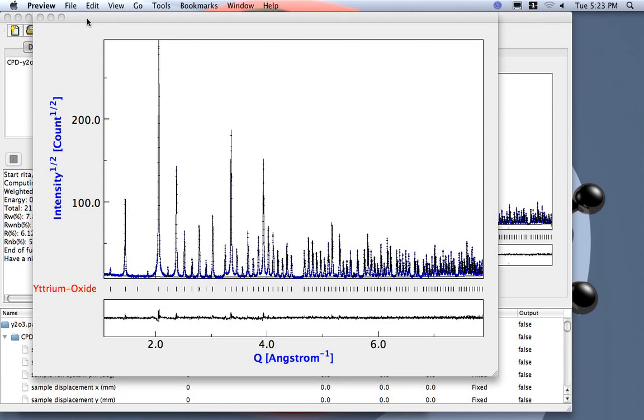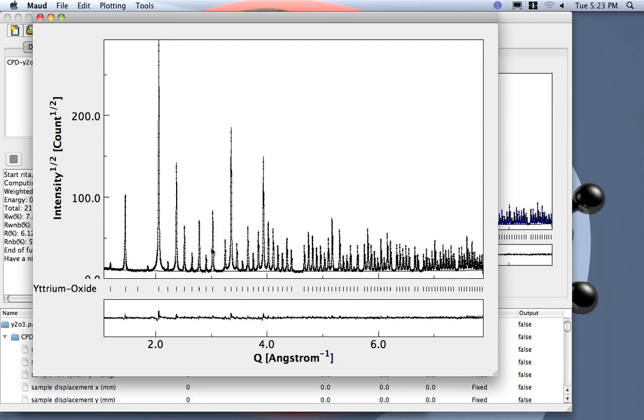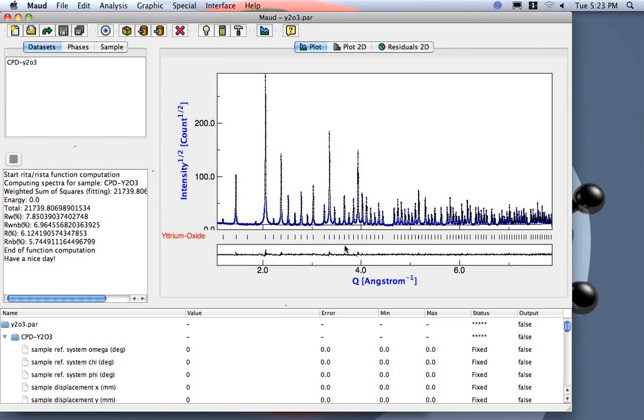For publishing purposes maybe you want also to plot in black and white. You can also do the same. So coming back, the same options applied here so you have all the positions of the peaks, everything.